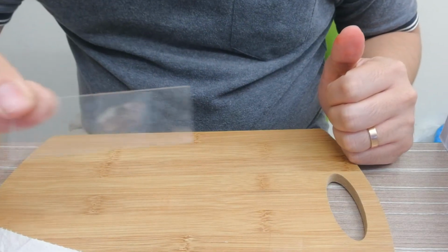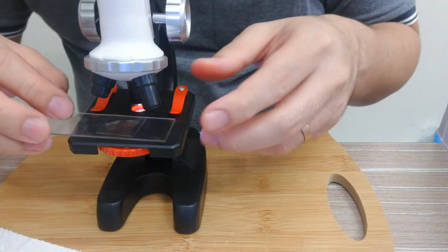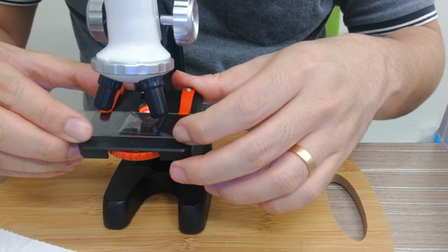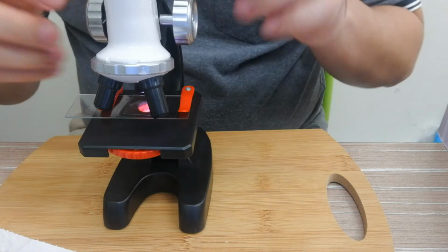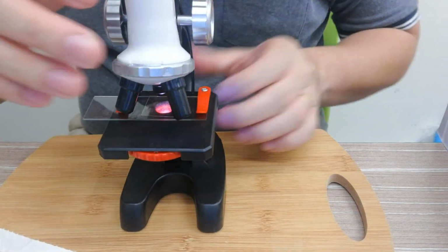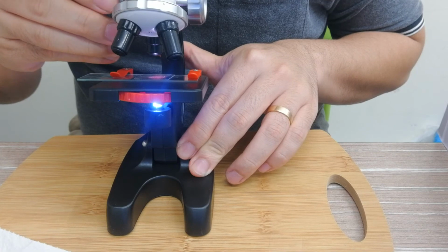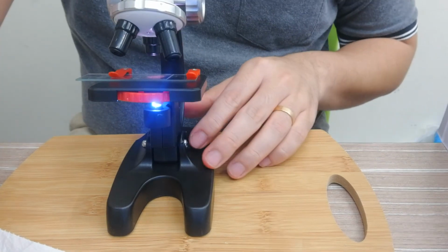What I'm going to do is put this onto the microscope. I'm going to use the lowest power. Then this is the dial for you to dial up and down, so that you can see the onion cell. Now I'm going to move the camera.